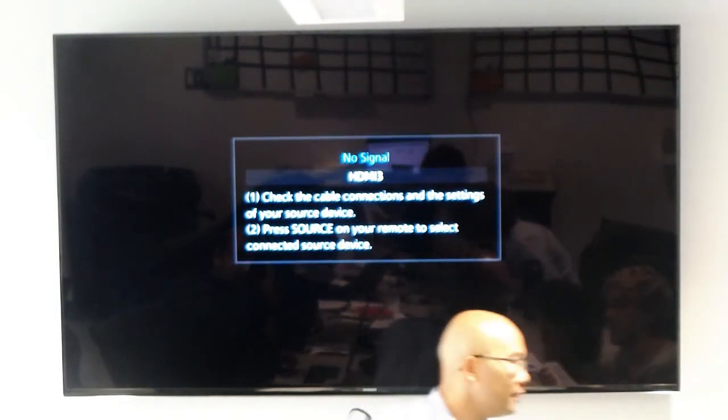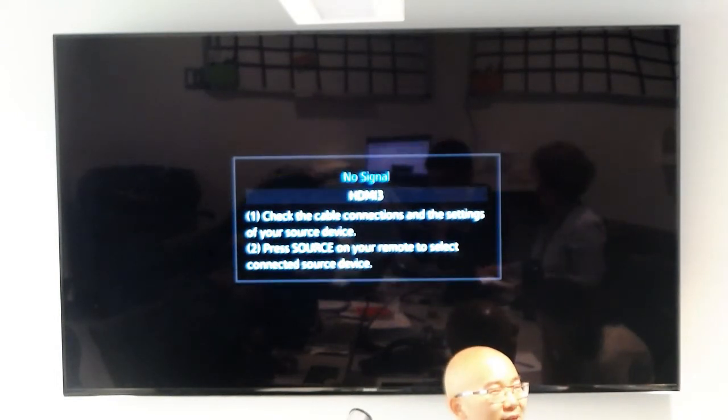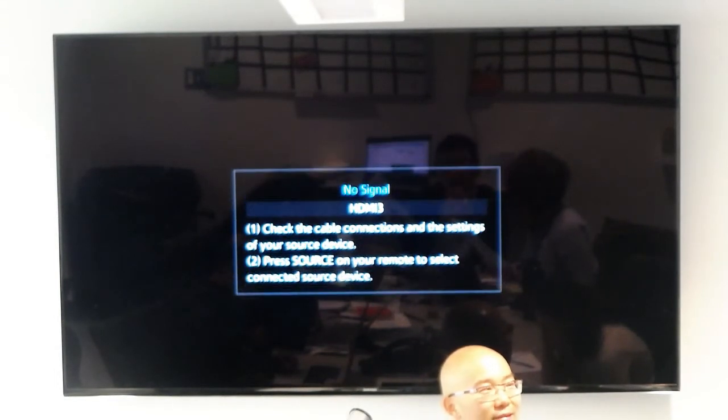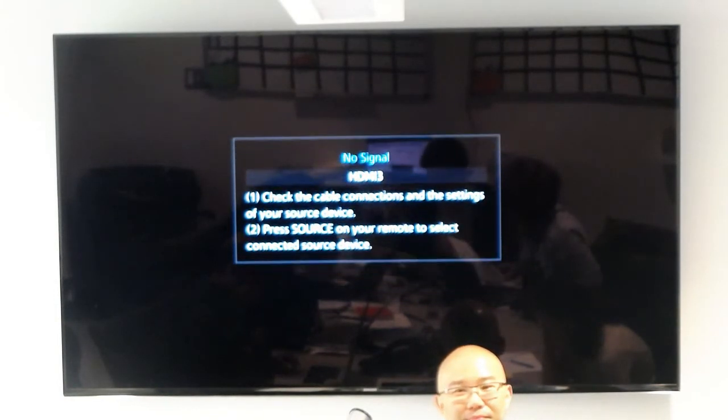So what are you doing? Well, let's see. They didn't extract the particles yet. So let's see if they have particles, if they'll still have that error. So I think the error is that it looked into probably the slowest place with 0 particles. Most of all.